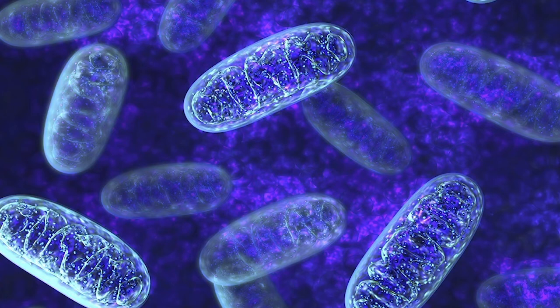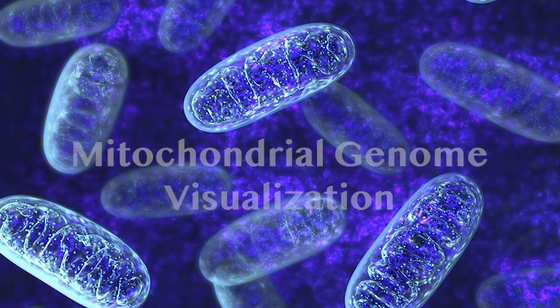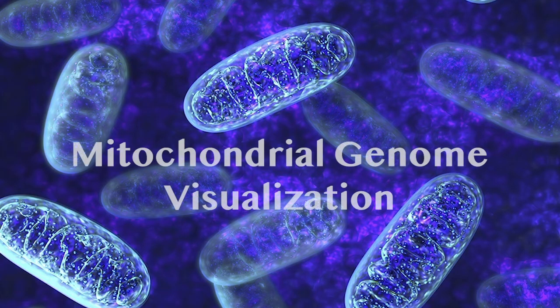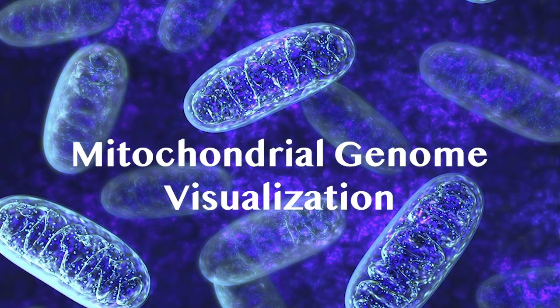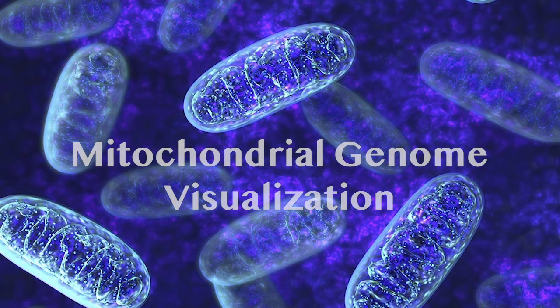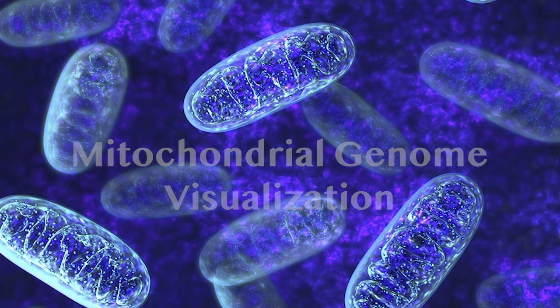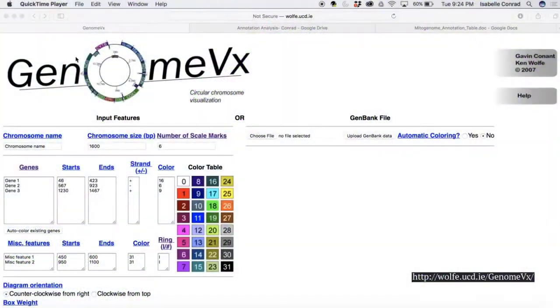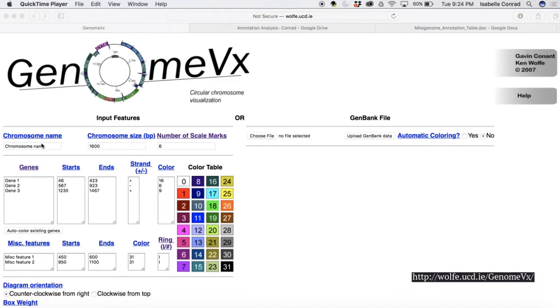This video is going to detail how to make a circular visualization of a mitochondrial genome using GenomeVX. It's a website, and the URL is down below in the right hand corner of the screen.